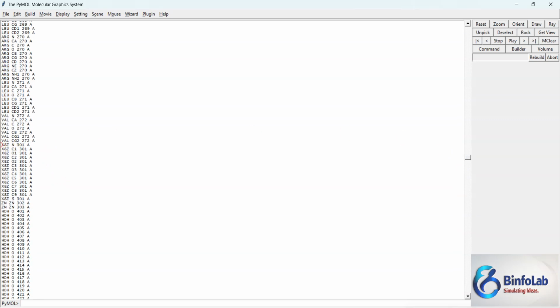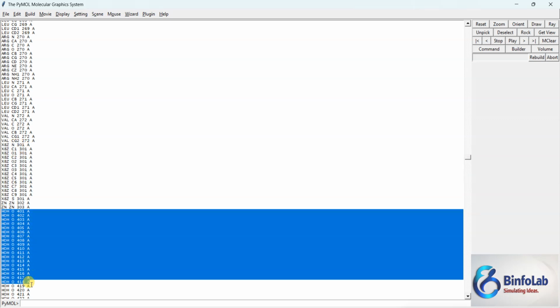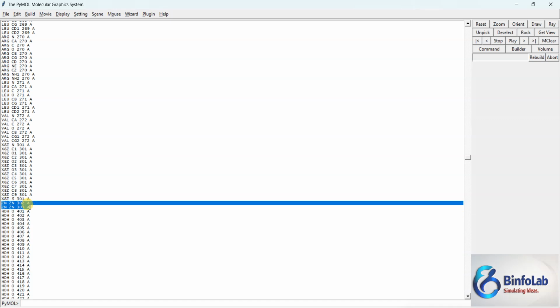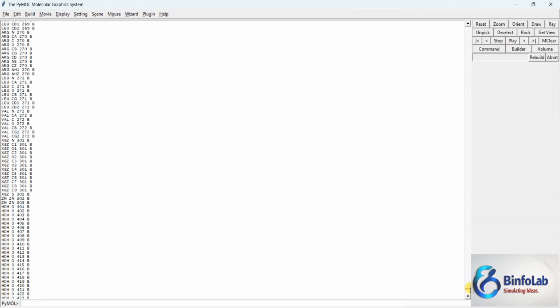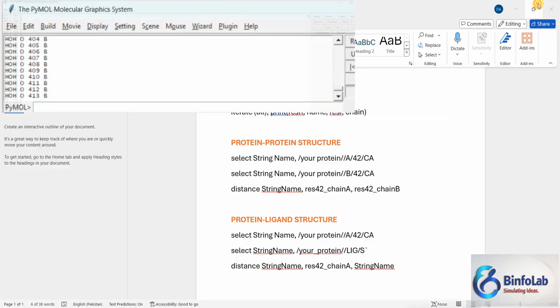So this is the ligand atom of chain A. These are the waters of chain A. These are the zinc atoms which are present in the structure of chain A. So this iterate command will print each and every atom for you, so it will minimize the chances of a mistake.